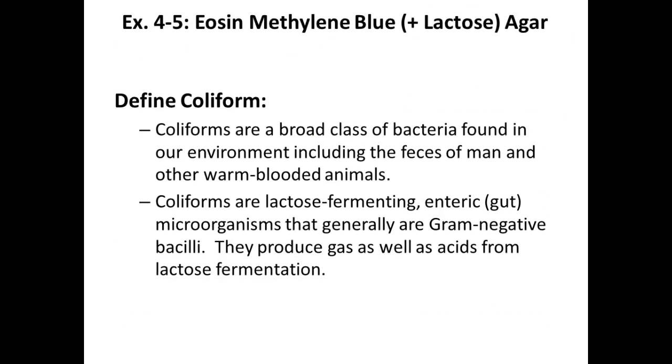All right, our last one. And I'm kind of bummed because my demo plate doesn't have my favorite organism showing up well on it. But one of you guys have it, and it's still nice and green, so we'll pass around your plate. Actually, I think it's your plate, Rain. No, not Raina. Who has E. coli? Who's got E. coli? Nobody that's here? The plate's out there. Somebody's got it. We'll find out in a moment.